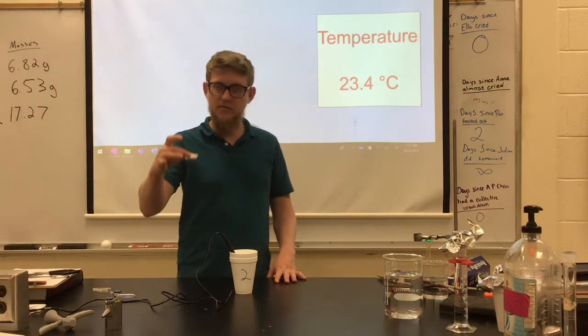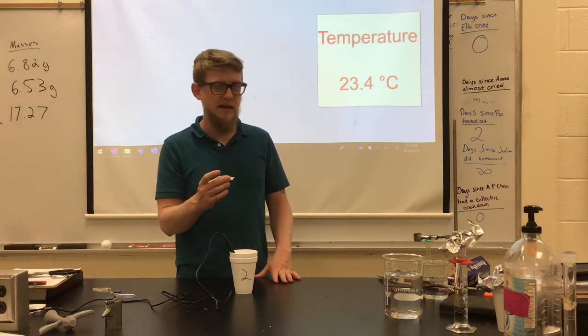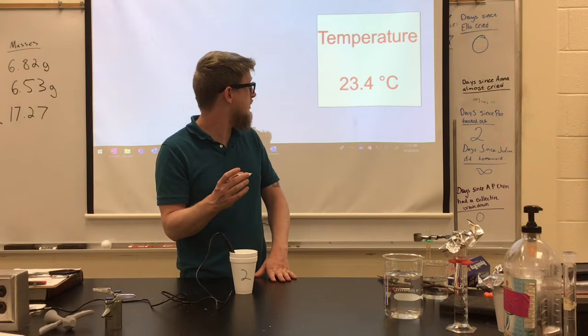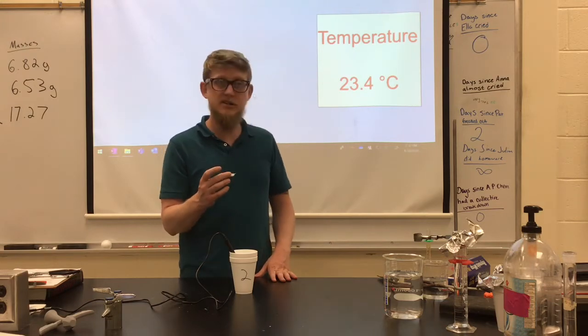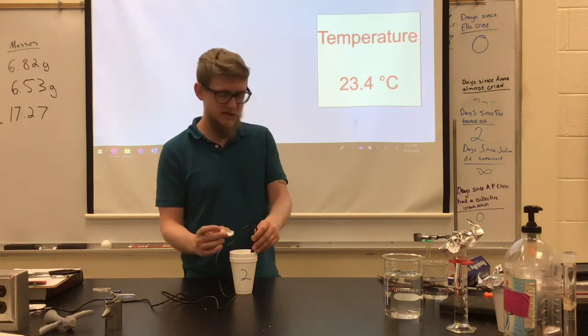I'm going to dissolve my 3 grams of baking soda, or sodium bicarbonate. Chemical formula is sodium, 1 hydrogen, 1 carbon, and 3 oxygens. Okay, so we're going to dissolve this and watch what the temperature does.